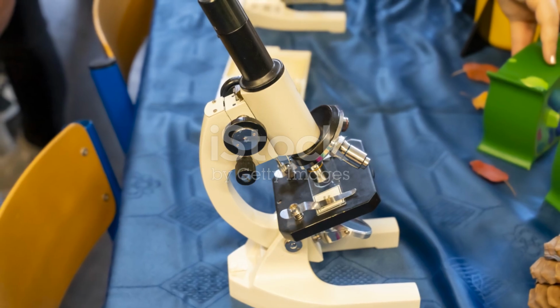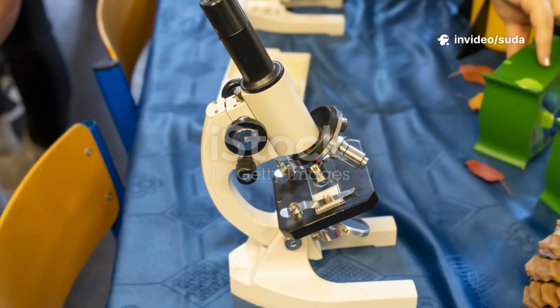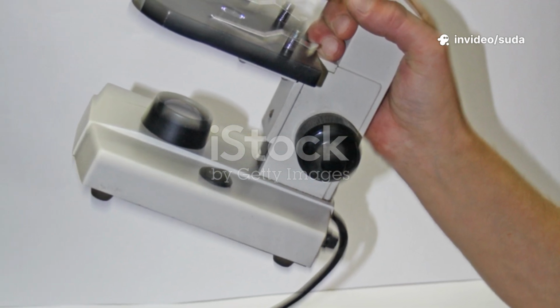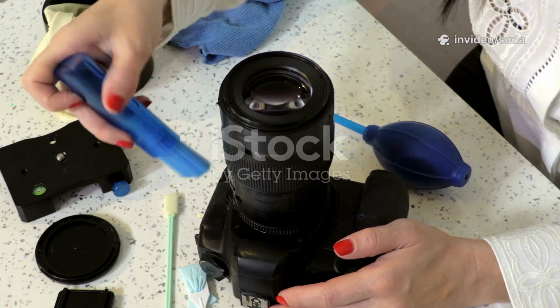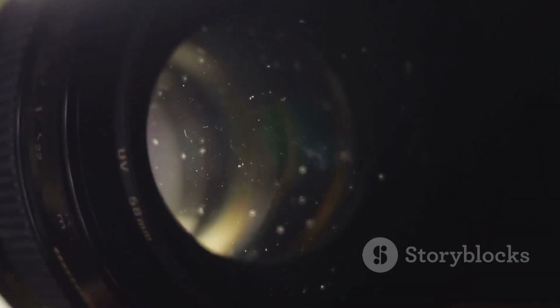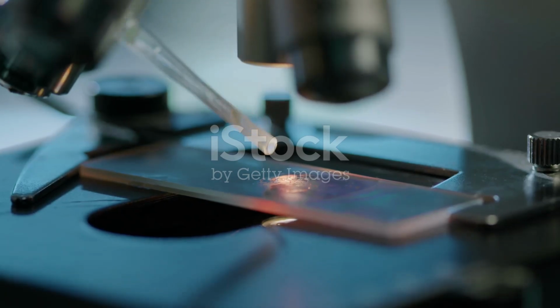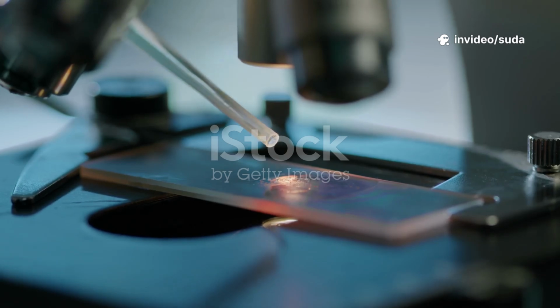Okay, you know the parts. Now it's time to use the microscope. Always carry with two hands, one on the arm, one under the base. Set it on a flat table and clean lenses with lens paper. Dust and fingerprints look like monsters under magnification. Add a drop or thin slice to a slide and cover it with a cover slip.